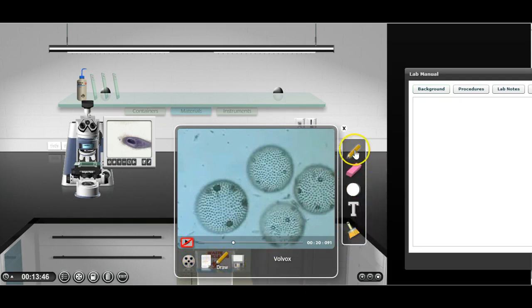So again, here we go. Kind of like the red lines. Of course, you could use any color that you like. And here we go. Right there, one of those little dark dots. We'll branch off and come down here to that one as well. This one right here. This one right here.